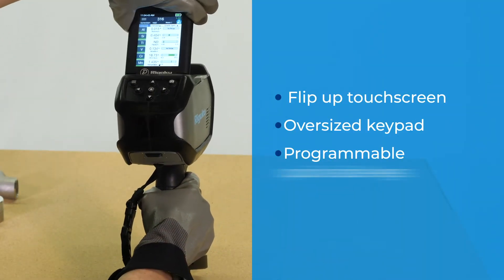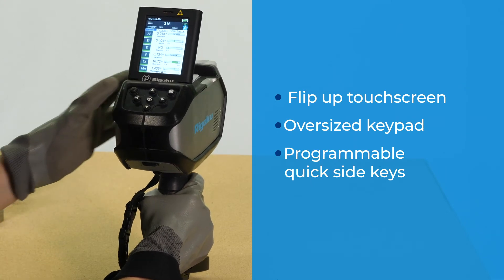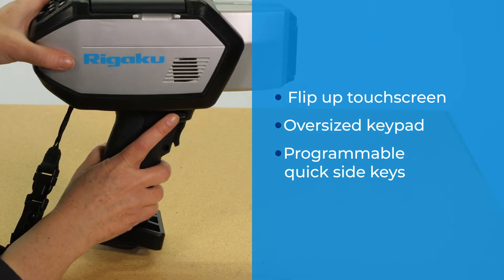Multiple axis user interface: flip-up touchscreen, oversized keypad, side quick keys — enabling single-handed operation.